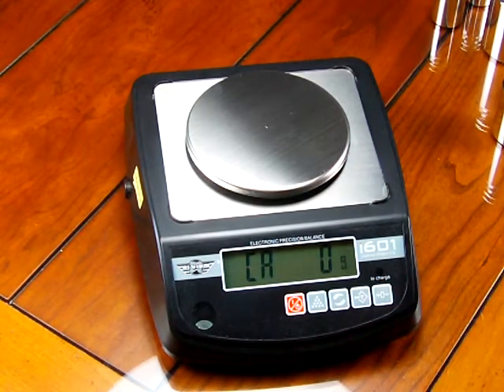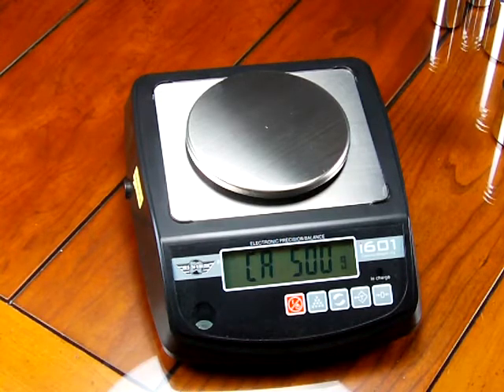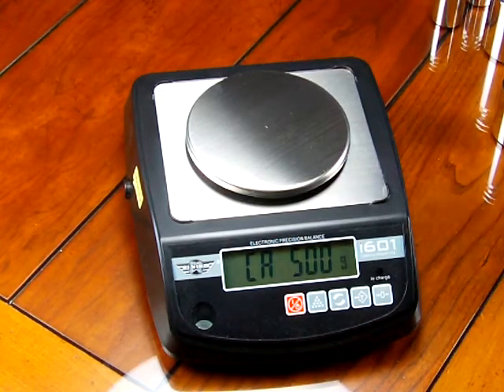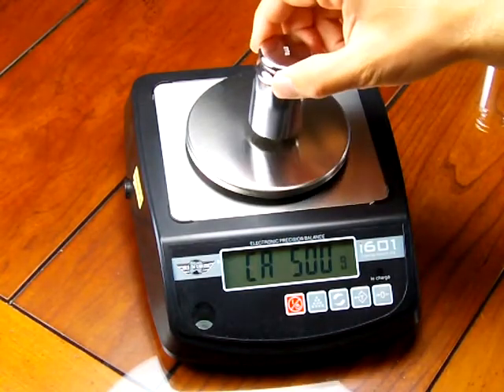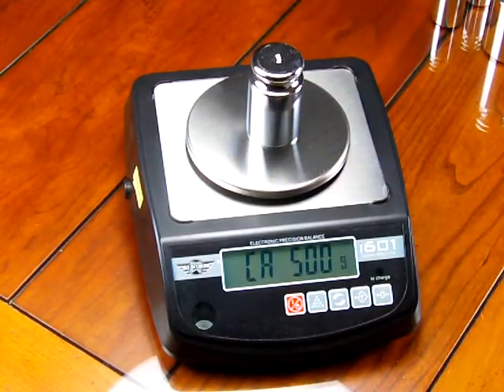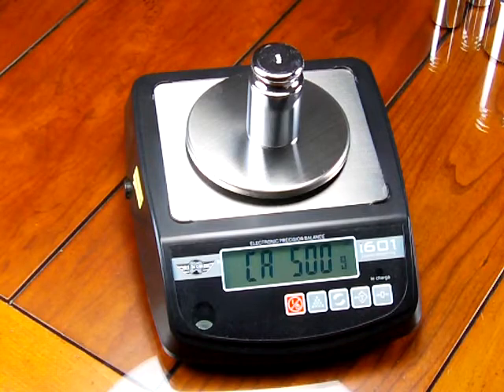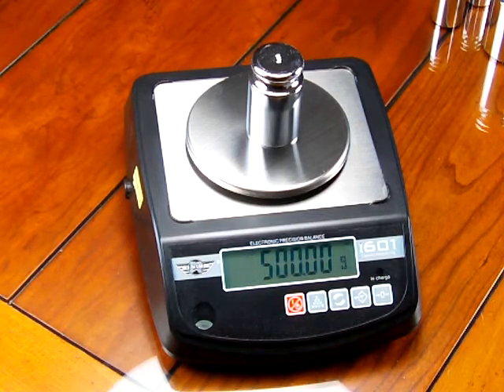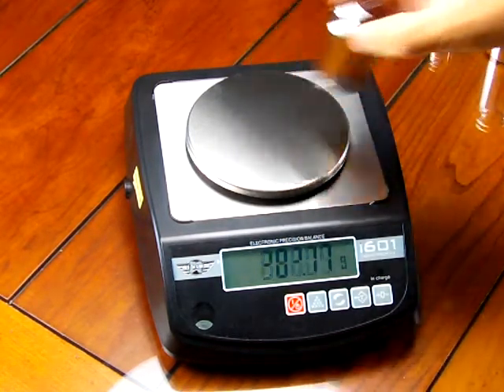And so the scale reads Cal zero and it stored that value with nothing on the platform. Now it is looking for 500 grams. So I am going to put my 500 gram weight on the scale. And now the scale beeps 500 saying that it's accepted it.